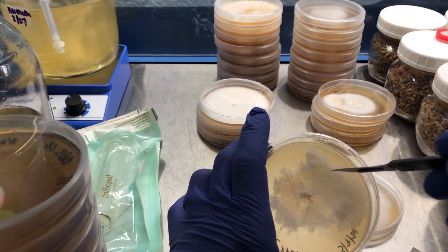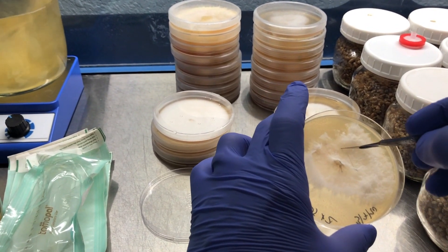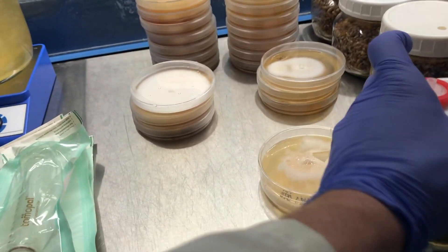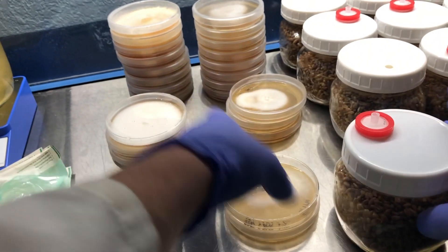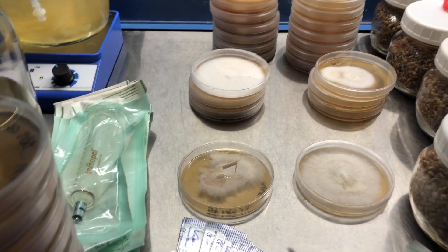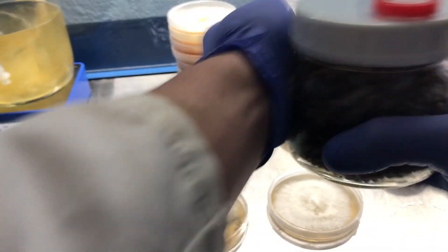I'm looking at this plate and right in here is some pretty rhizomorphic mycelium, so I'm going to want to select from that region. I'll just cut out a nice size wedge — that's all you really need. Then I'll just give it a little shake so that wedge gets jostled a little bit into the grains.